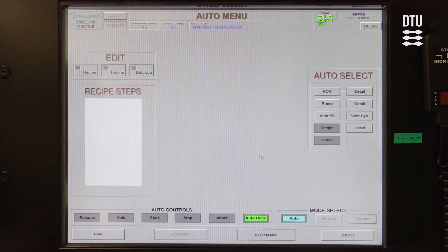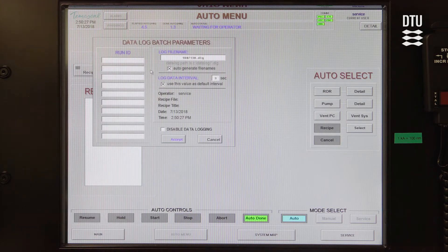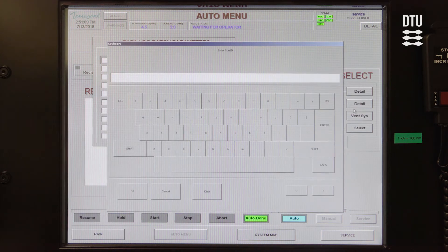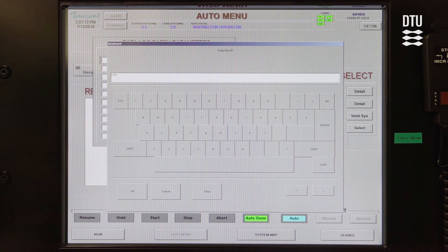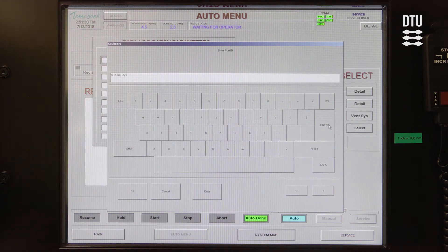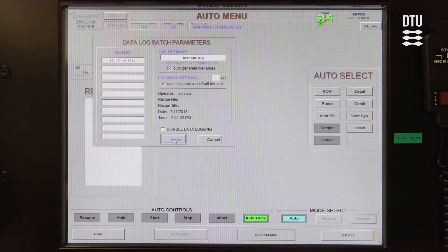Before you start your recipe, you also have to configure the data log. The data log saves the process parameters during your deposition. It has a log file name that you need to put into the process log — please use the auto-generated file name. You should also put something in the Run ID, for example 'Ti 15 nanometers, 1 angstrom per second'. This is so that if you look in the log file later, you can see what you were actually trying to do, because that may differ from what actually happened during the deposition. Then press Accept.